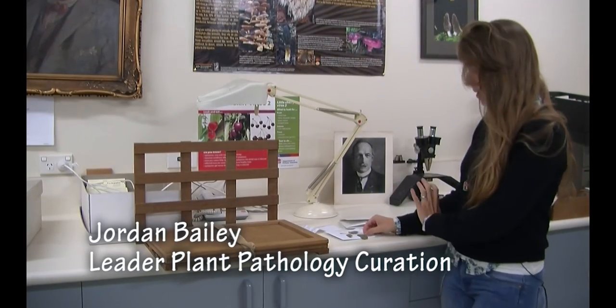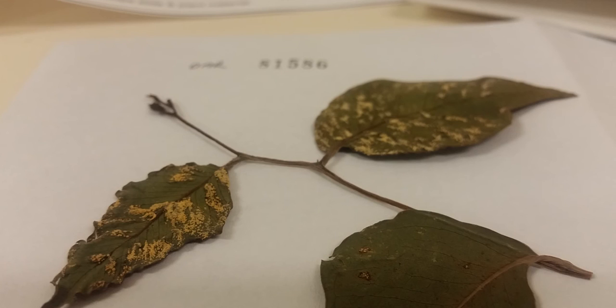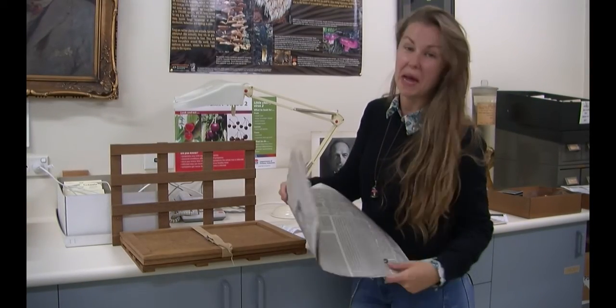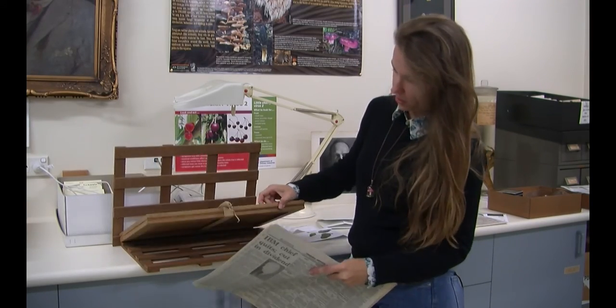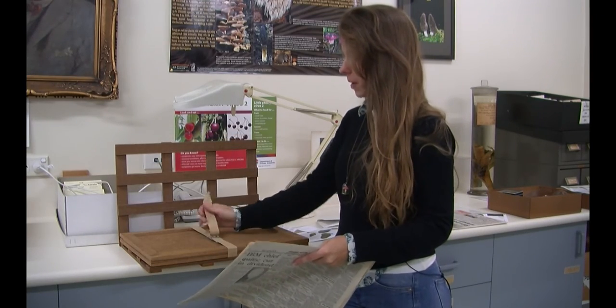You'll notice this specimen is nicely flat — the leaves haven't curled up and dried up — because when you collect them, we use newspaper mostly, or whatever paper you have lying around in the field, and you place the plant between it. This absorbs all the moisture, and then you put it between two planks of wood and use a belt to tighten it.